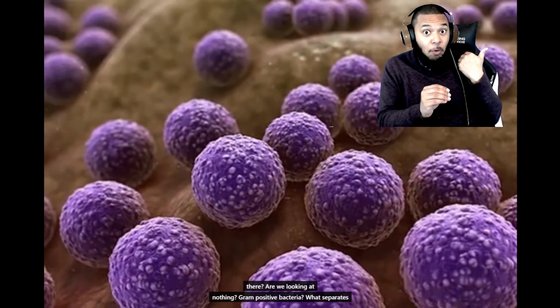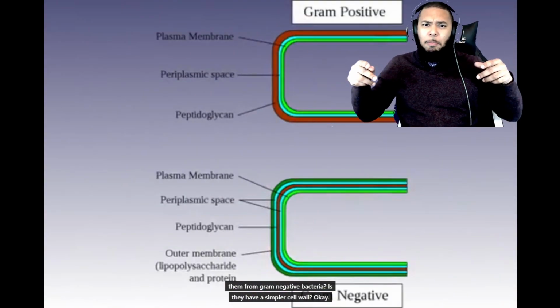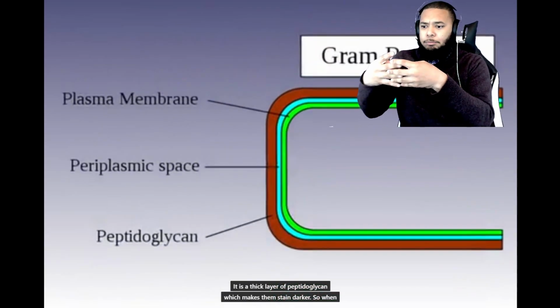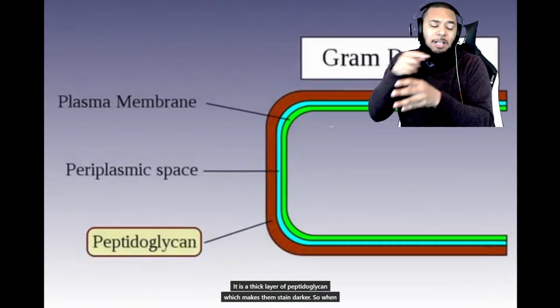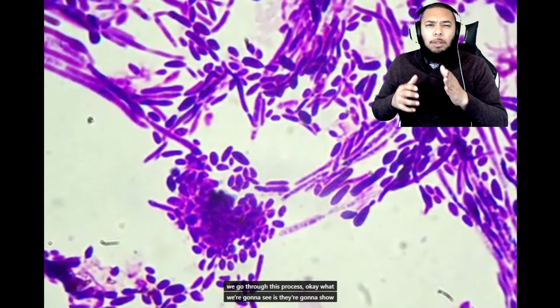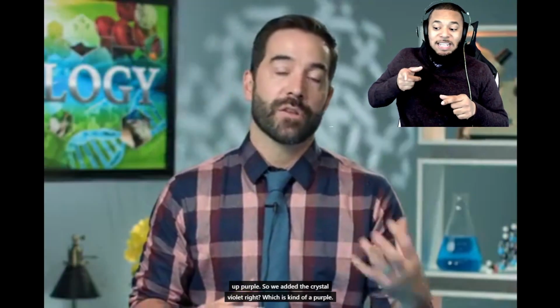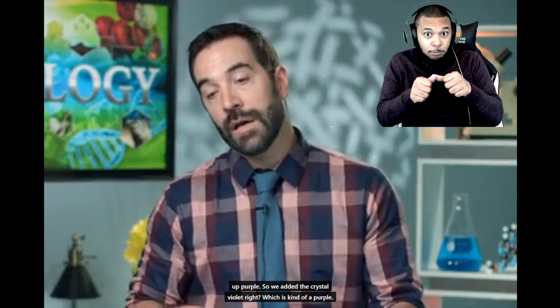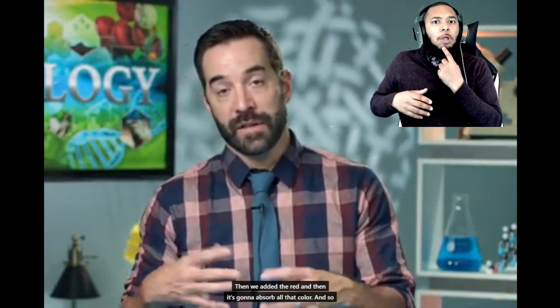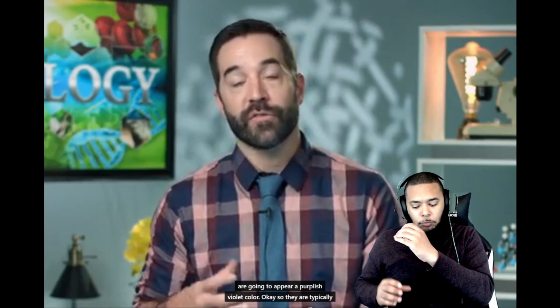What separates gram-positive bacteria from gram-negative bacteria is that they have a simpler cell wall. It is a thick layer of peptidoglycan, which makes them stain darker. So when we go through this process, what we're going to see is they're going to show up purple. We added the crystal violet, which is kind of a purple. Then we added the red, and they're not going to absorb that color. So when you're looking at a gram-positive bacterium under a microscope, they are going to appear a purplish violet color.